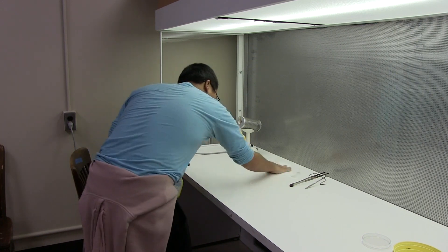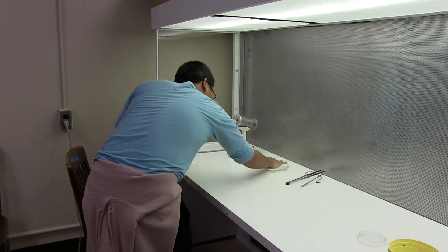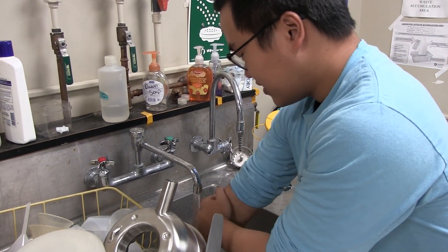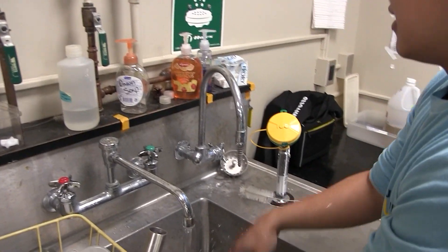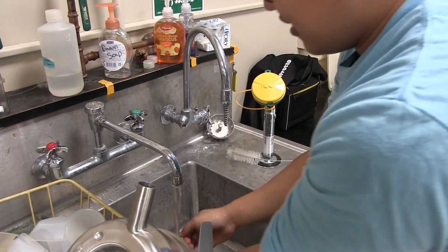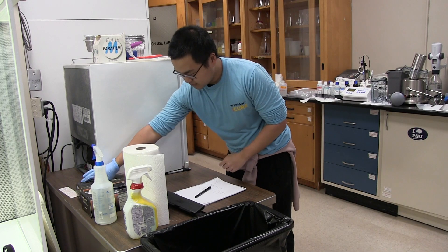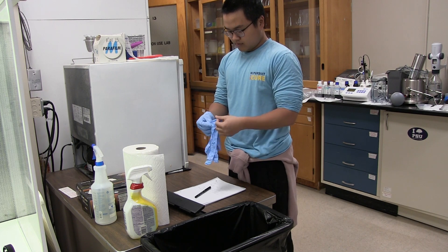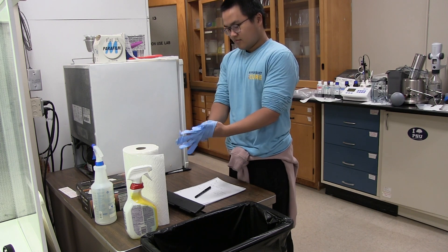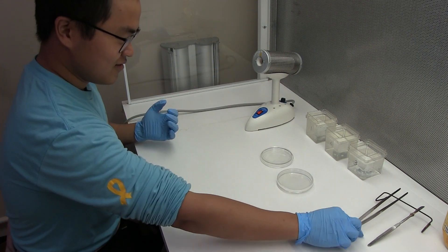Disinfect the workstation where you will perform your tissue culture, preferably under a laminar flow hood. Wash arms and hands thoroughly with disinfectant soap. Sterilize your forceps and scalpel in the back incinerator.